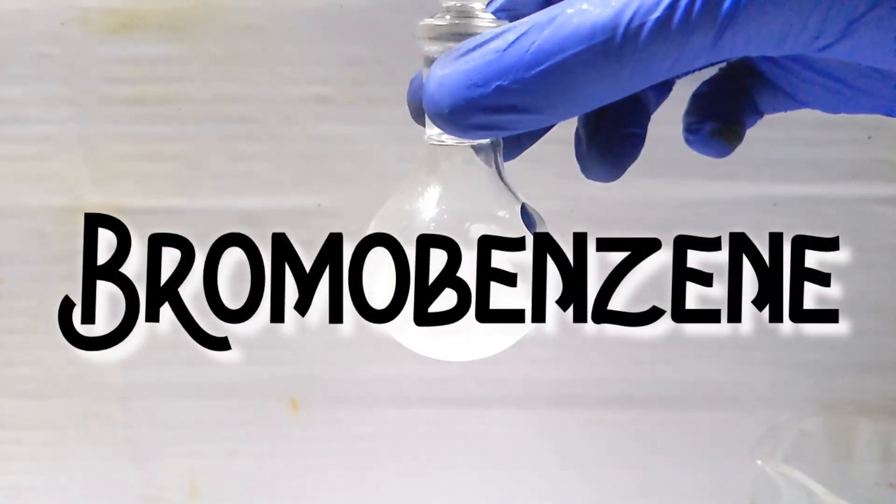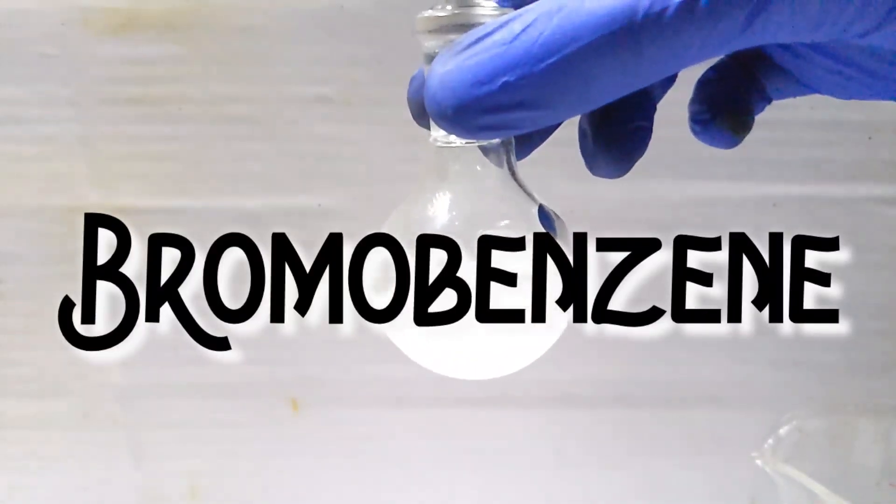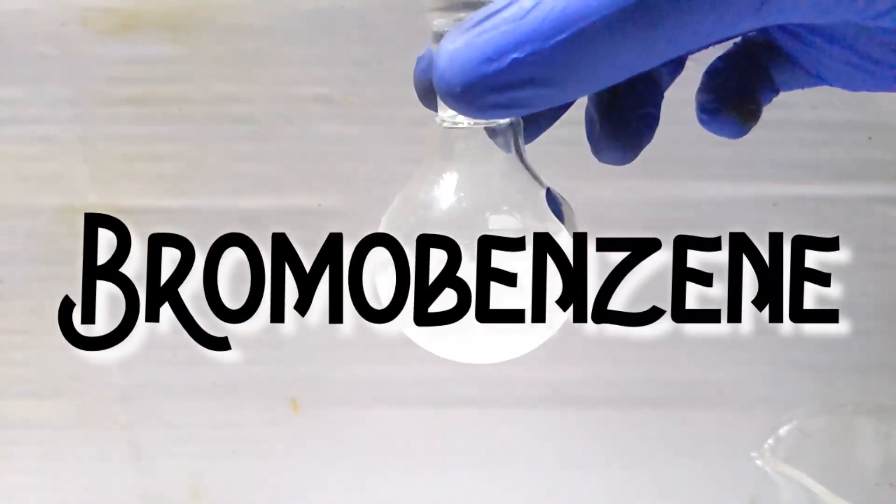Hello friends, in this video we make an aryl halide, bromobenzene, via the direct bromination of benzene.